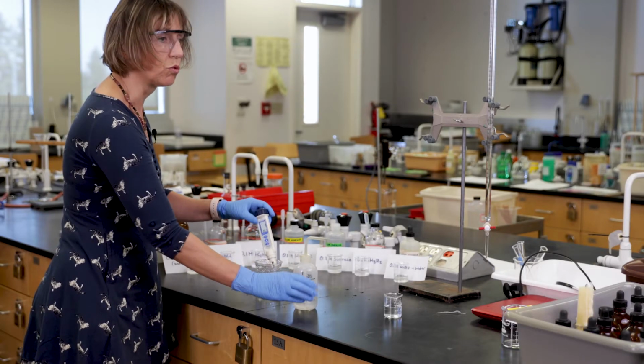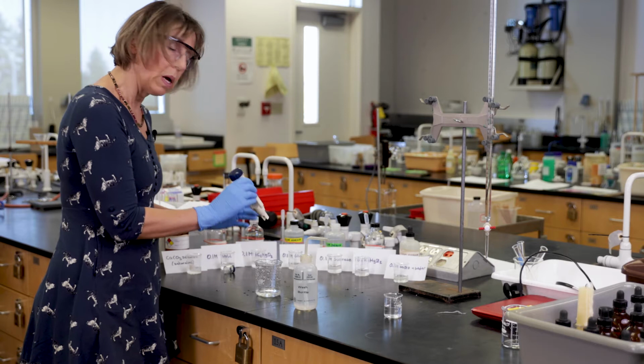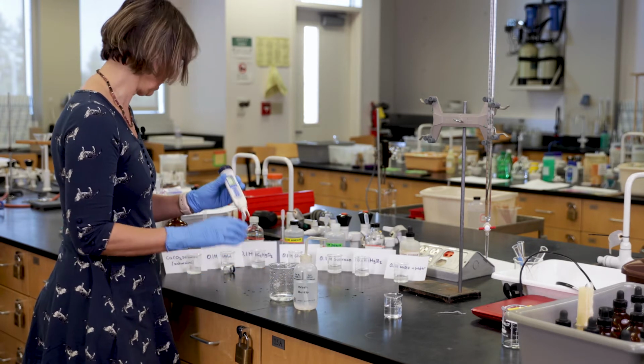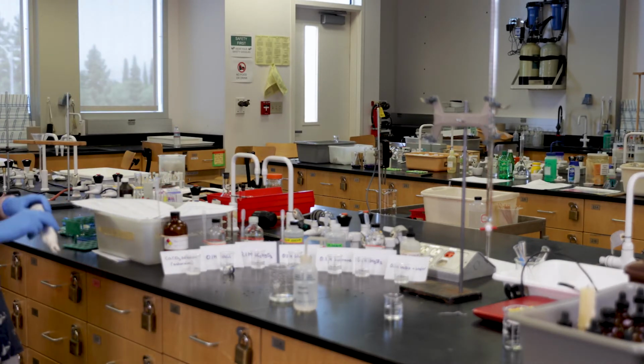And you now want to identify which one is a strong electrolyte, a weak electrolyte, or a non-electrolyte.